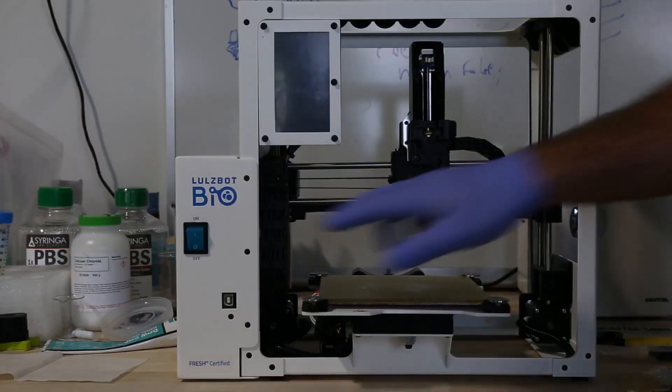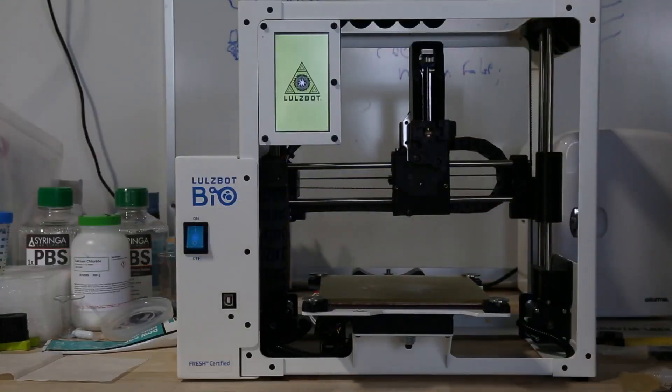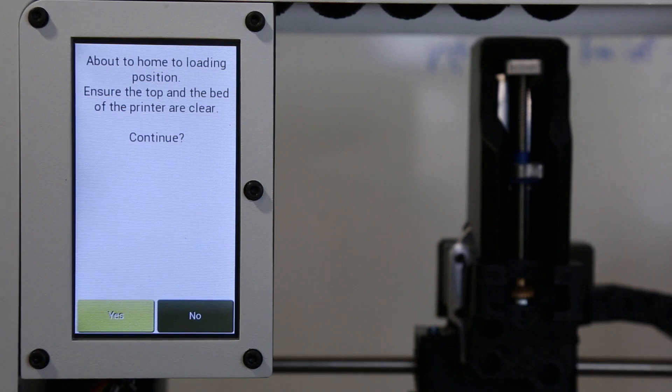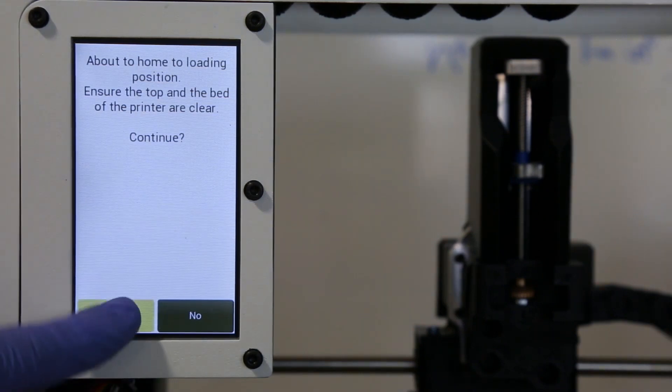So now I'm gonna power on the LulzBot Bio. It'll run us through a startup routine. The first thing it's gonna ask is that the bed and on top of the printer is clear. So I'll say yes.